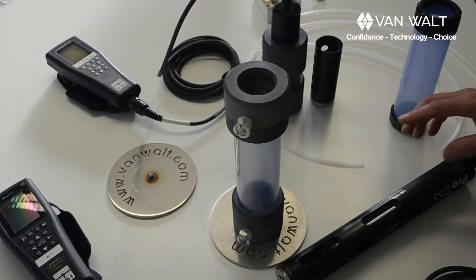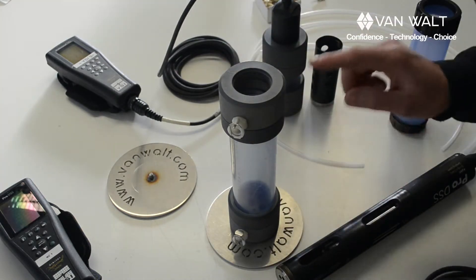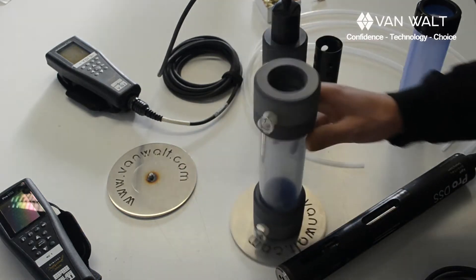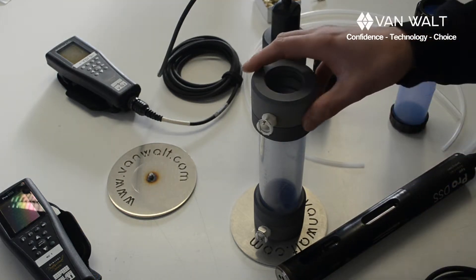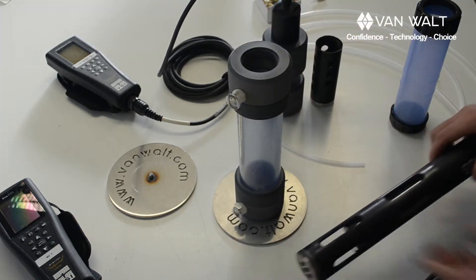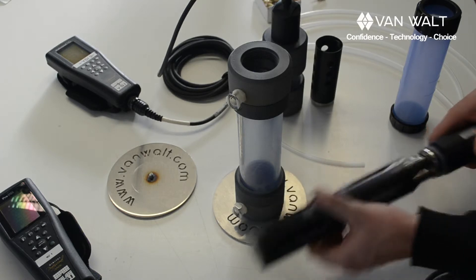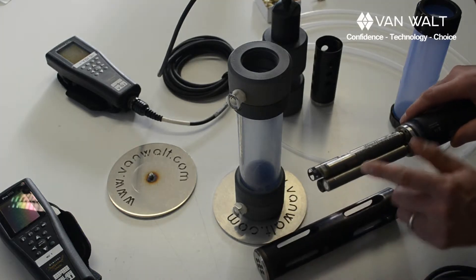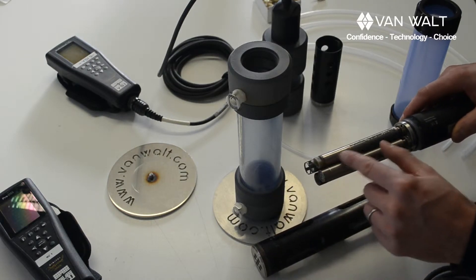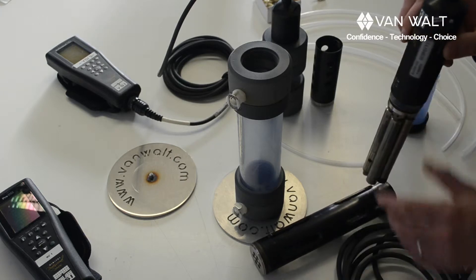You should know that we should be using the flow cell upright. We've actually supplied additional bases for these flow cells so they're easier to keep upright. One of the reasons for that is if you have it on its side, you may not get a correct reading from the probes. If you look in here, the conductivity probe requires flow through it and if there is an air bubble or something then you're not going to get a correct reading. So better upright.